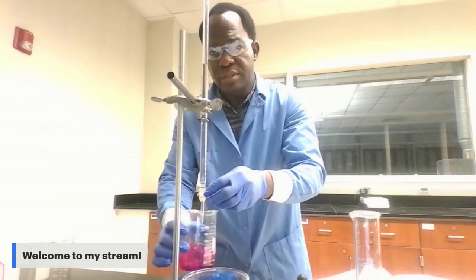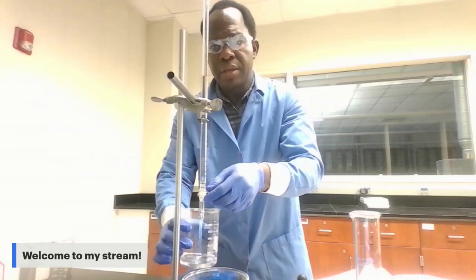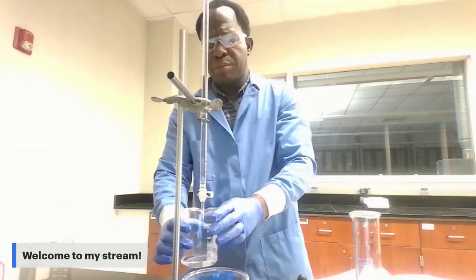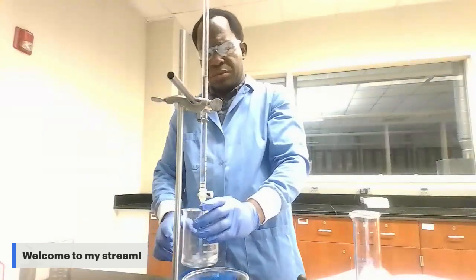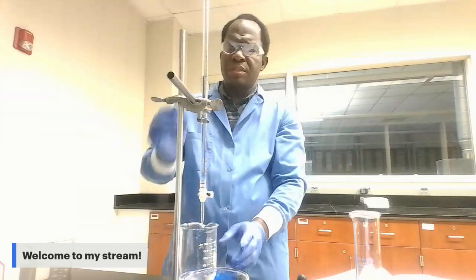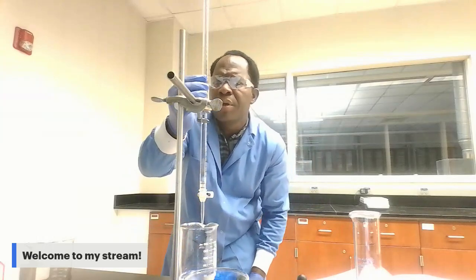As soon as the solution changes to clear, you stop the titration. You stop the HCl. So this is what we got. I'm going to proceed to the reading now.